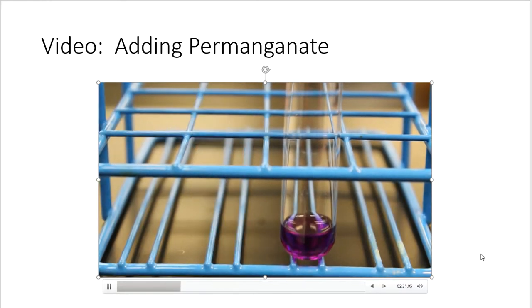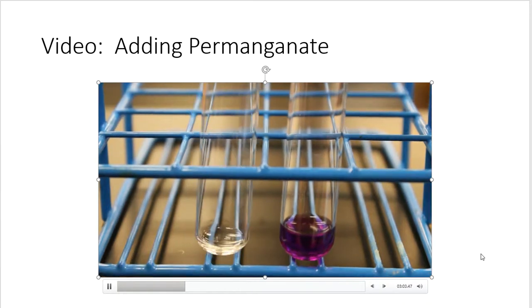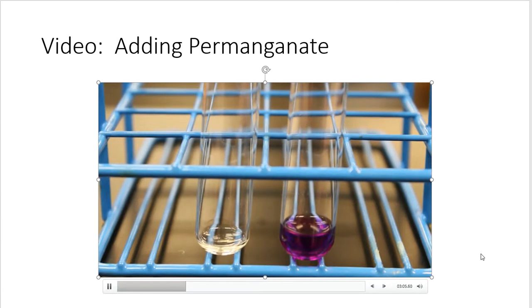So I'm going to take the octane, I'm going to set it aside after those 20 drops. If I do get a purple color, it tells me to slow it down. All right, it just tells me to stop whatever I'm doing. Here's mineral oil. And then record that number of drops that it took to get purple.